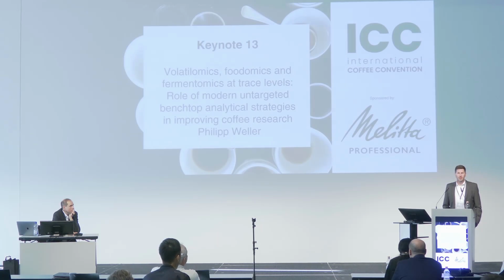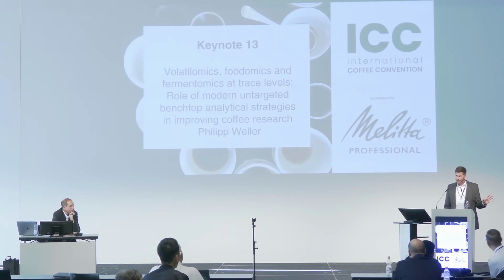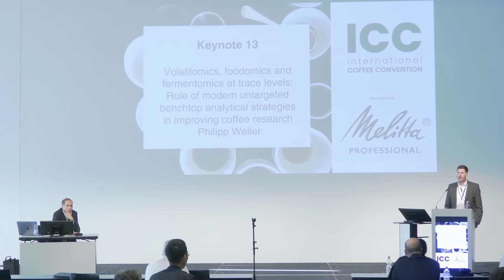Contaminants, pollutants, I'm always a bit careful about saying this will work, because contaminants is a broad field, and pollutants as well. So I would not be so confident saying this is the perfect tool for screening for pesticides. The perfect tools for that are LC-MS and GC-MS, going for targets at a lower range. This is a non-target based system, so I would not try to put everything into one system. That's never a good idea in analytical chemistry. But for screening purposes, I'm sure about the defects, yes. Thank you very much. You're welcome.